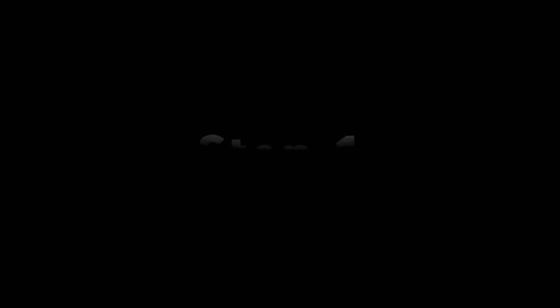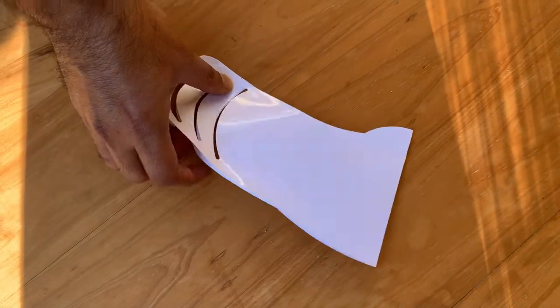Barrier face mask — how to apply. Step 1: Pick up the face mask without touching it on the inside.